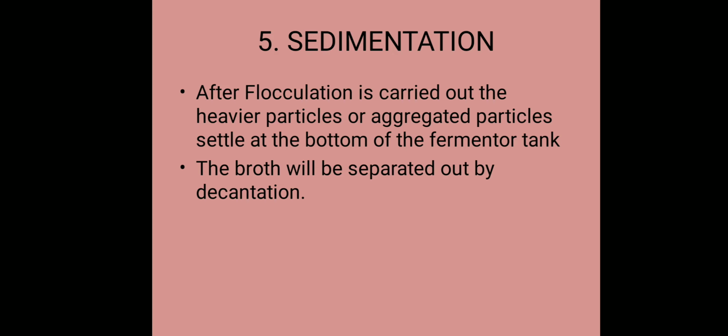So using these various methods, we can remove the cells or other products from the culture broth. These are the various methods used in industries for removing the insoluble materials or cells from the culture broth. This step is also called separation of solids from liquids.